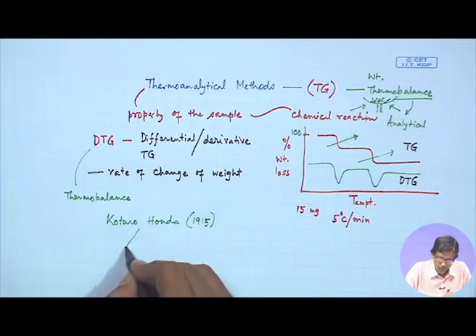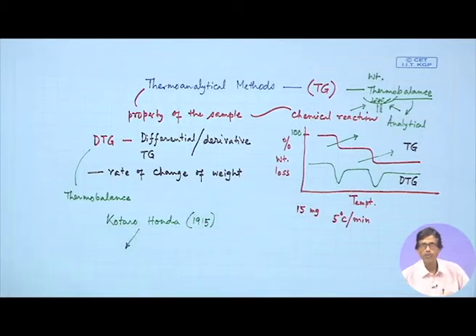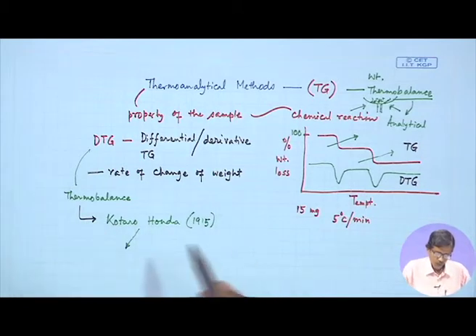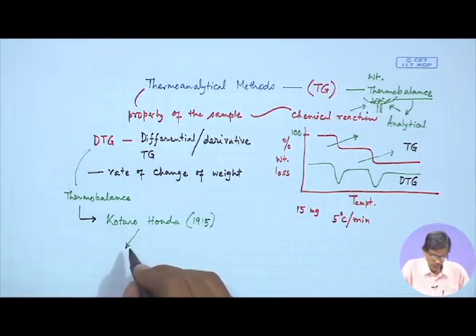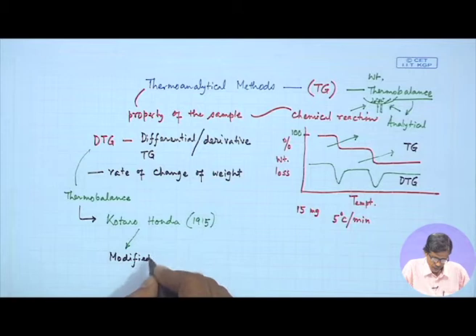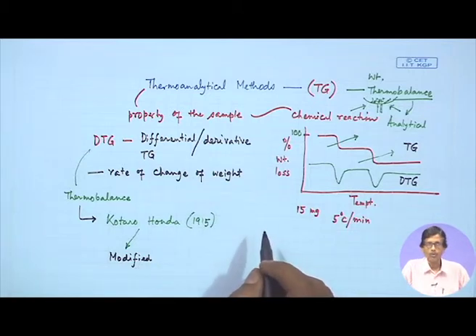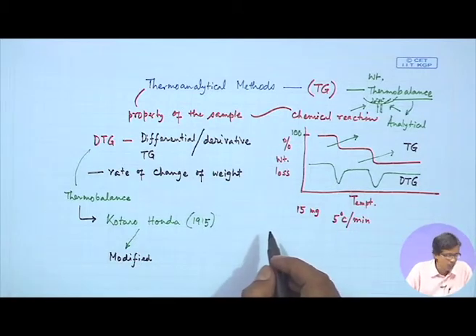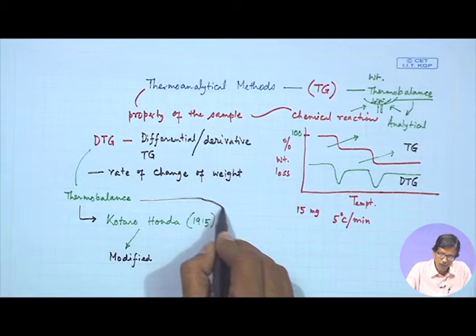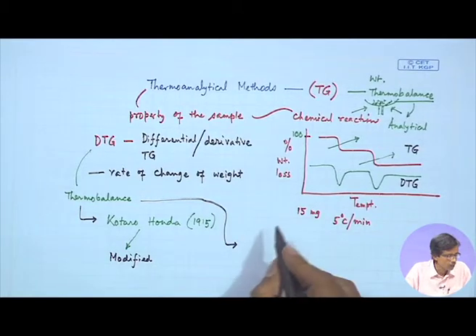Later on most of these have been modified, and we still use different modified forms of the balances introduced by Kotaro Honda in 1915, but the basic concept for measuring all these is very simple and well known.